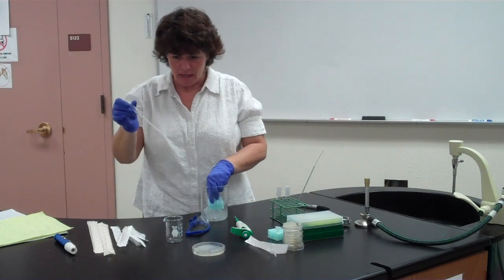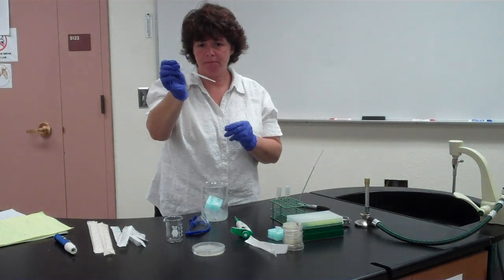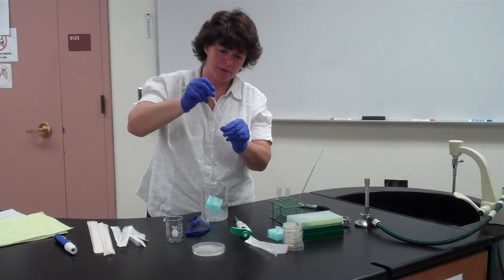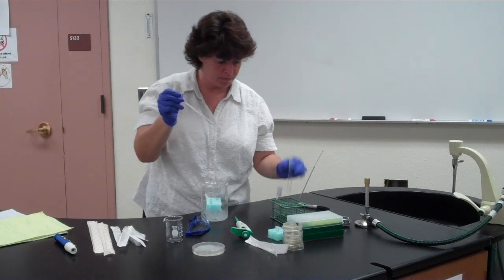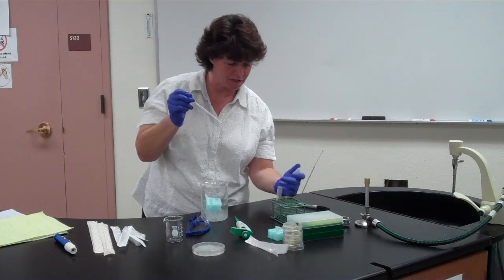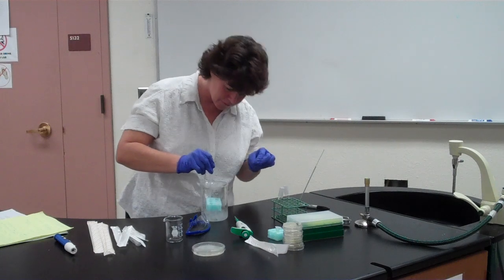Okay? And once again, we want to be as sterile as possible. When using this pipette, you squeeze it before you put it into the solution, and then as you slowly bring it up, you go to where you need to go, and you put the same stuff in both of your tubes. We're not flaming these tubes right now like we've done in the past. Okay, I'm going to get another 250.